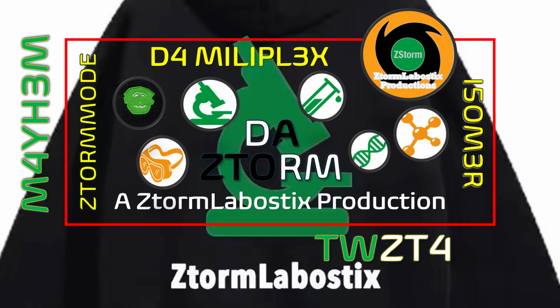These files of data are then decoded through base calling algorithms to determine the sequence, and create BAM files to allow investigators or researchers to evaluate and analyze.